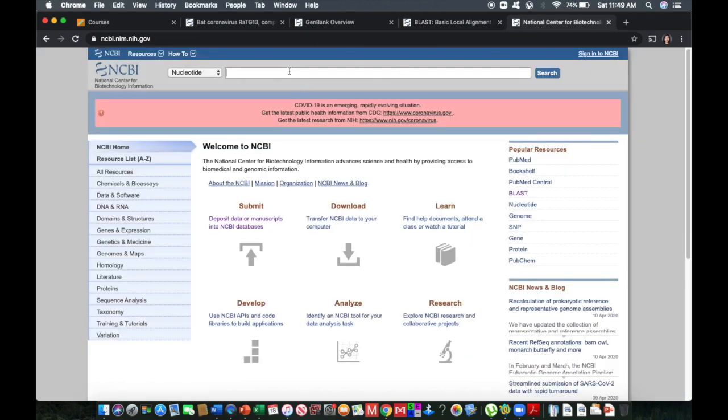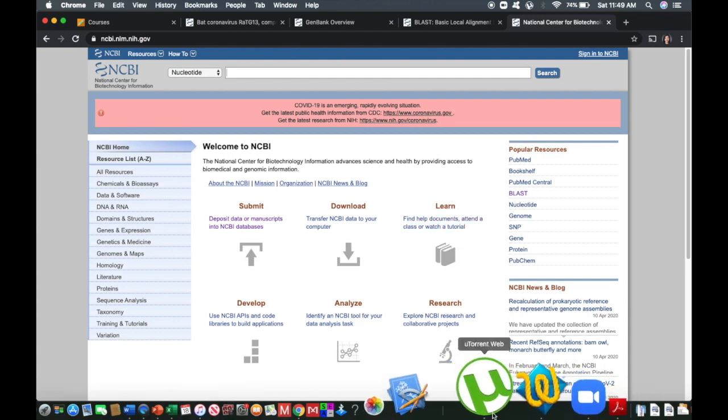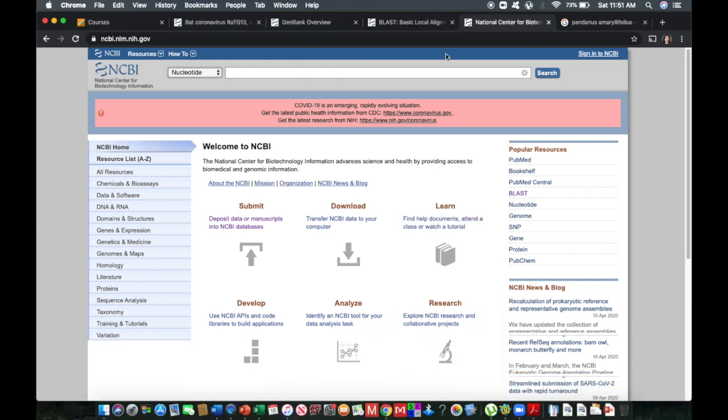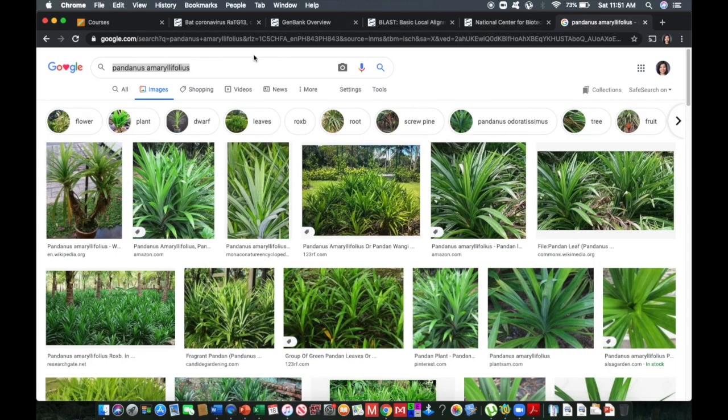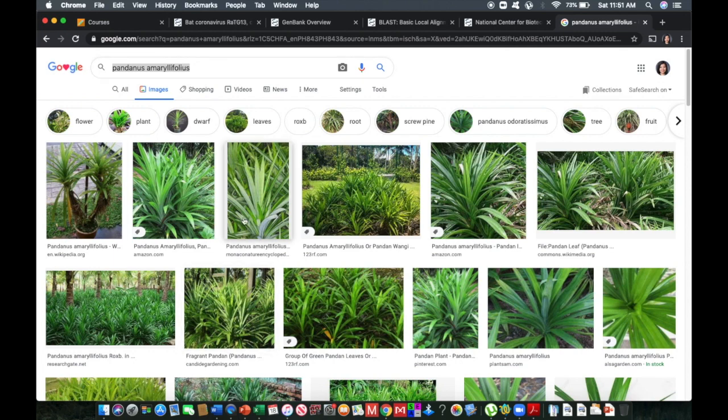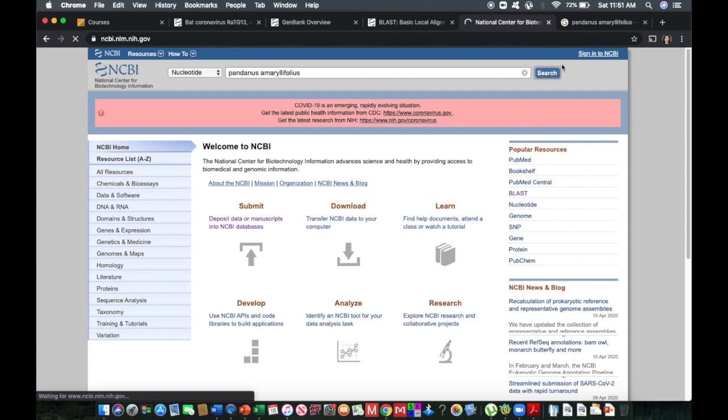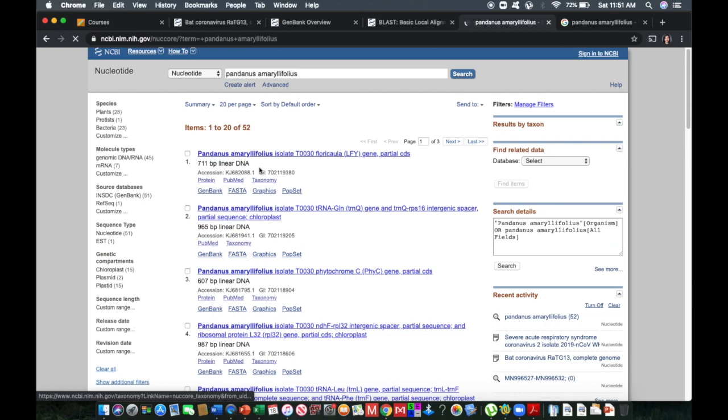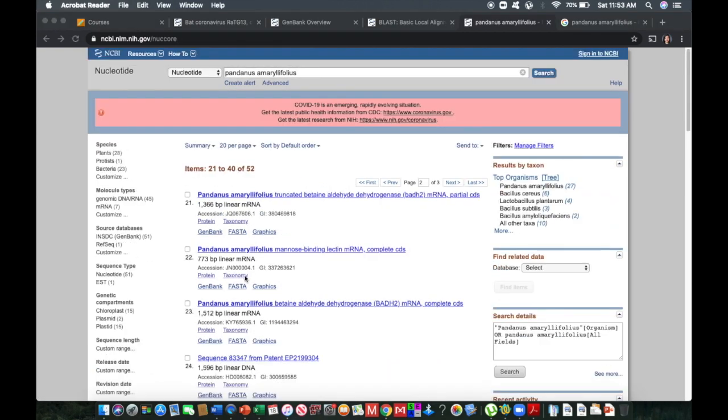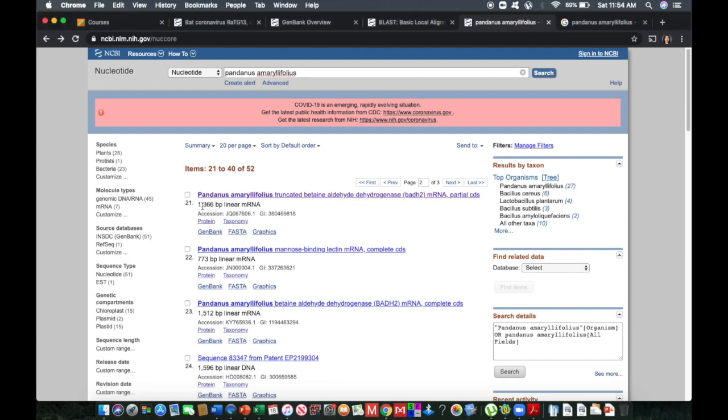So for nucleotide searches, for instance, I would like to know if there is a sequence of Pandanus amaryllifolius. So this is commonly called pandan mabango in the Philippines, utilized for the pandan desserts, pandan flavored desserts that we have. So I'm interested in searching for what particular nucleotide information is available for Pandanus amaryllifolius. So hitting search, just wait, be patient.